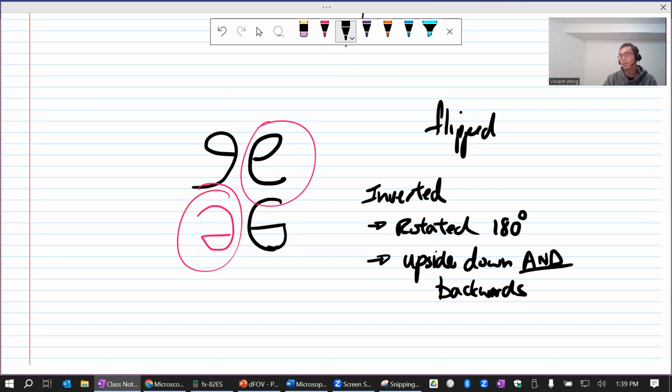Why is O not good to show this property? It looks the same, right? Even if you flip it upside down, rotate it, reflect it, the O looks like the O, and you wouldn't know what happens to the image. So things that are symmetrical are not a good choice. Give me something else that's not a good choice besides O. Capital H, right? Yes, that's right. S is a perfect example. If you rotate S 180 degrees, it looks exactly like the original S. So it's not just left-right symmetry, sometimes it's rotational symmetry as well.